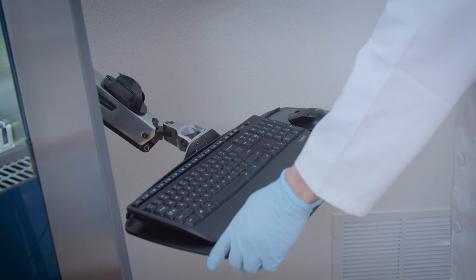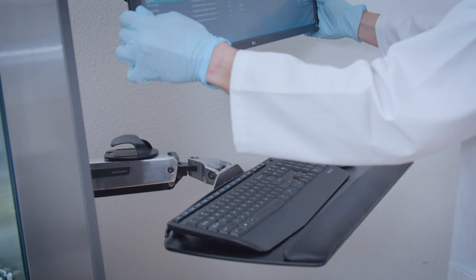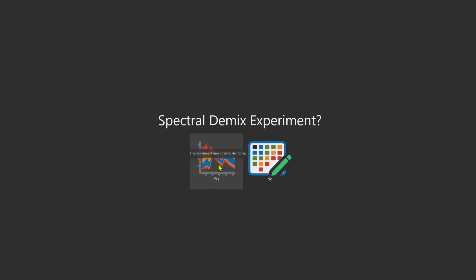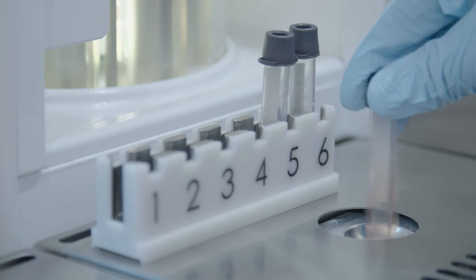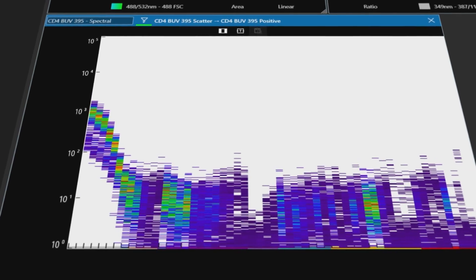The ergonomics of using the instrument are greatly enhanced by the adjustable keyboard tray and monitor, allowing for individual preference when running the sorter. The Bigfoot Spectral Cell Sorter's clean user interface with intuitive workflow and integrated features provides simplified acquisition, analysis and sorting.